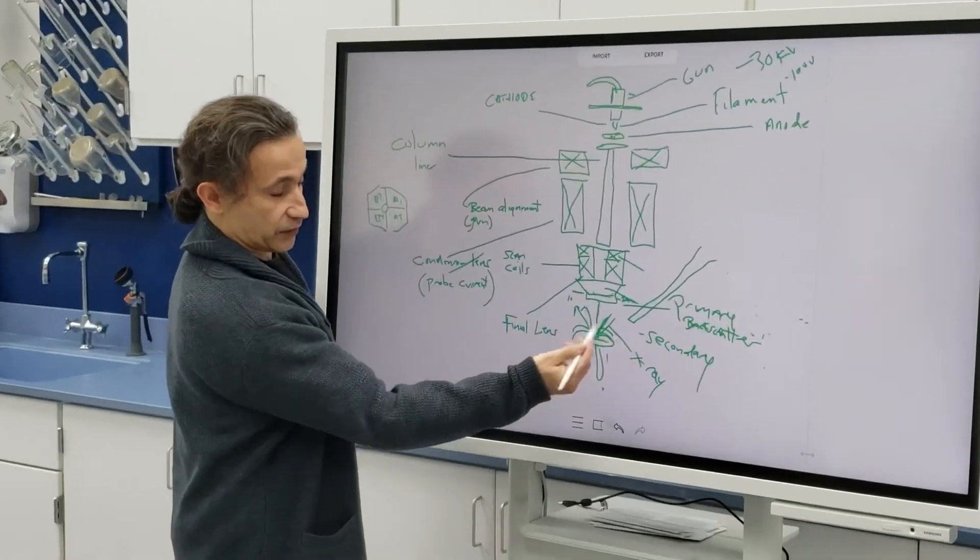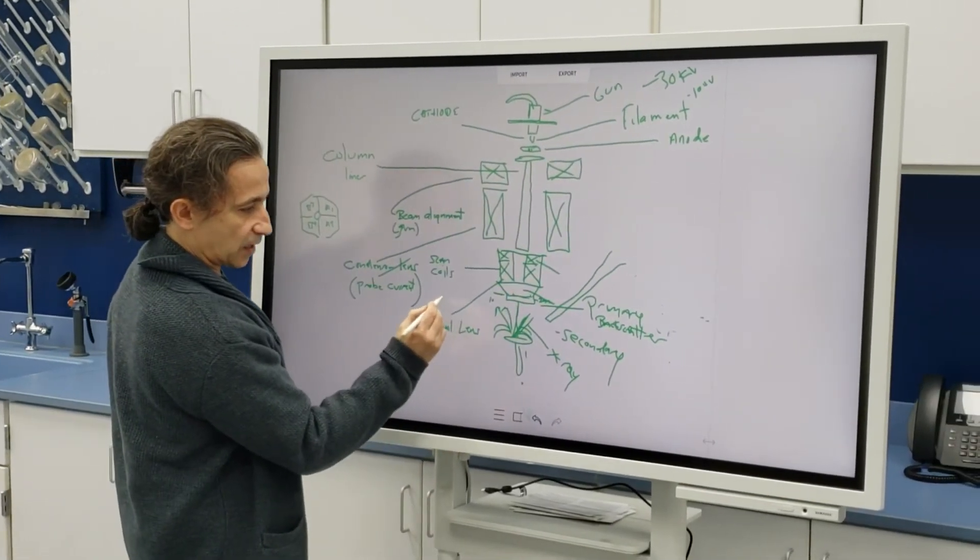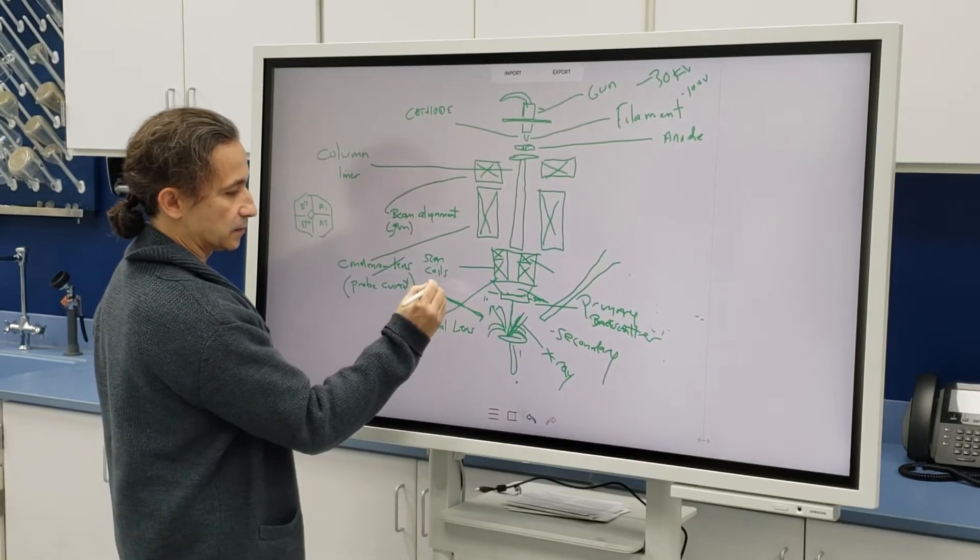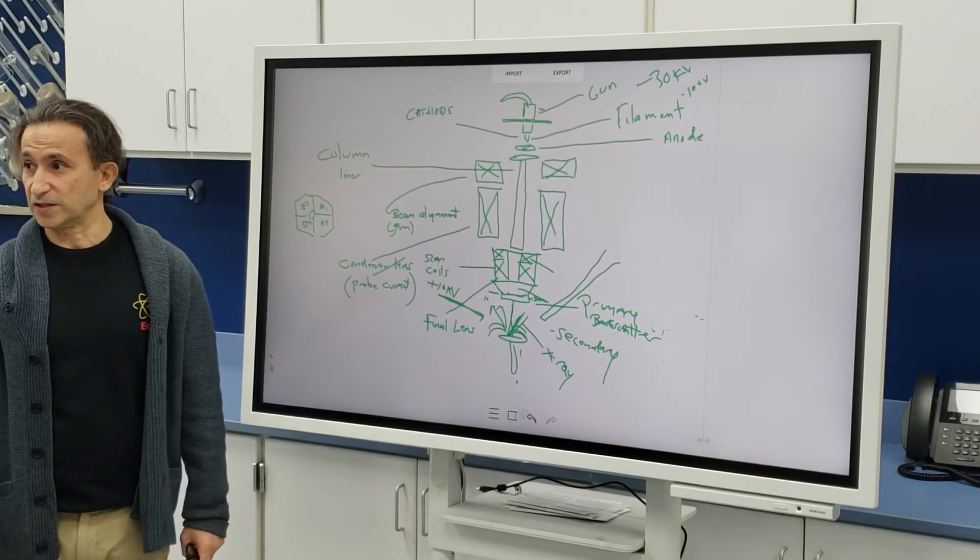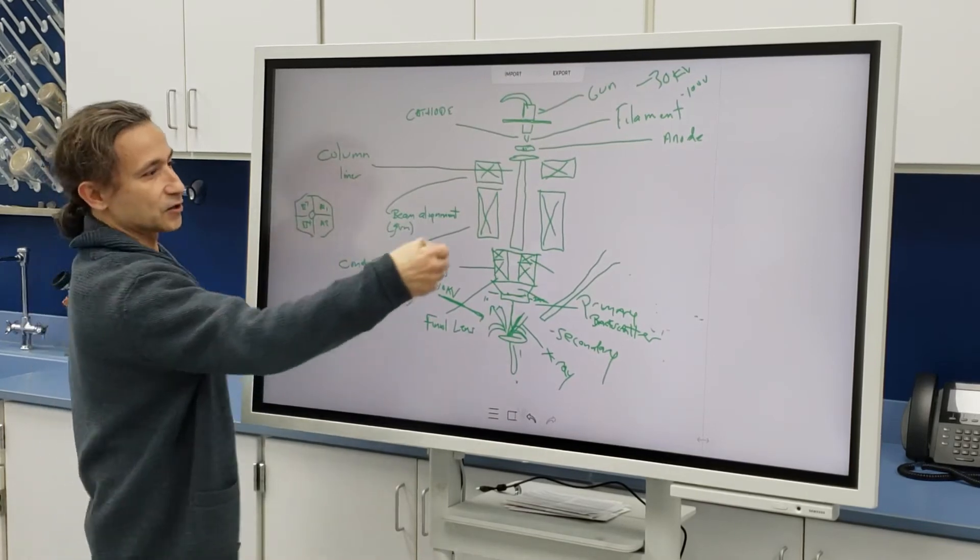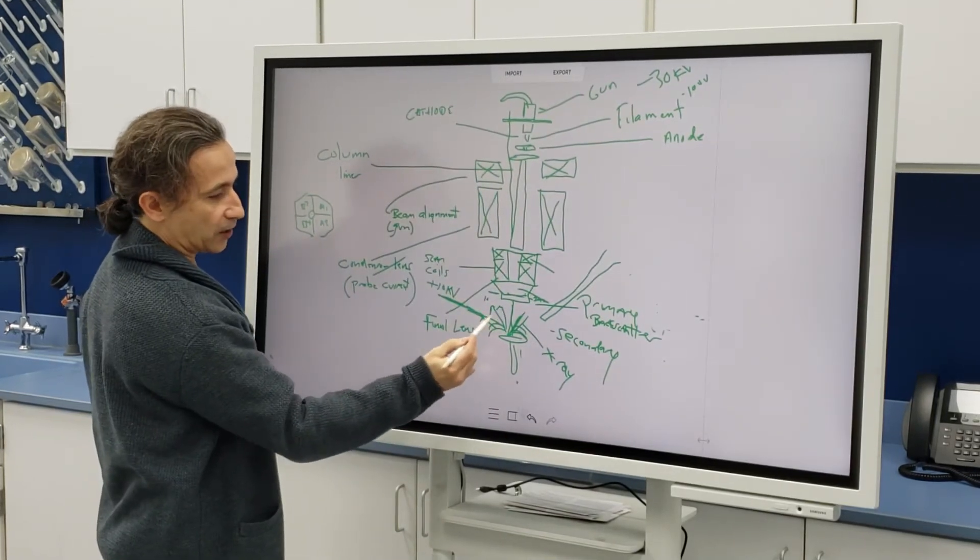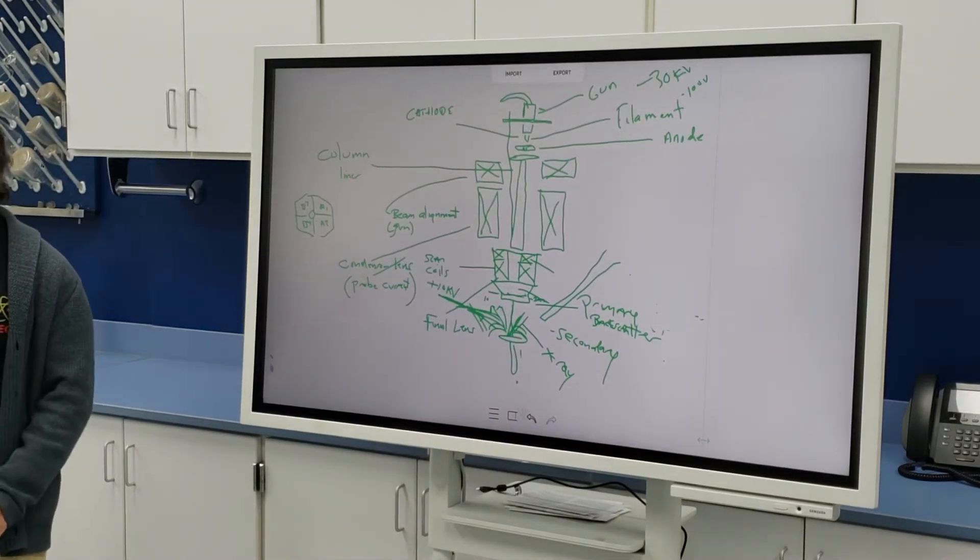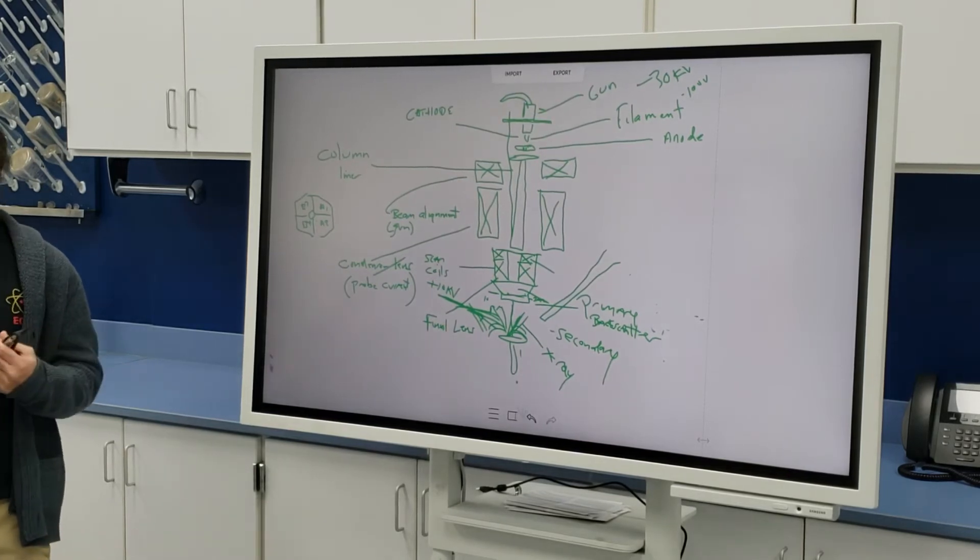Other events are happening off of it as well, and those are obviously x-ray events. That's what the x-ray detector coming off the side will be picking up. How do these electrons get to anything? You have an x-ray detector that's picking that up. You also have a secondary detector that's coming off the side here. It's a finger, realistically. And this guy is sitting at plus 10 kV. So you've got negative 30, 20, 10, whatever you have there. You have a very strong path of conductivity. Electrons are shooting down the column, hitting the sample, and they're immediately flying over to the secondary detector. That's going to give you your best viewing, your best topography.